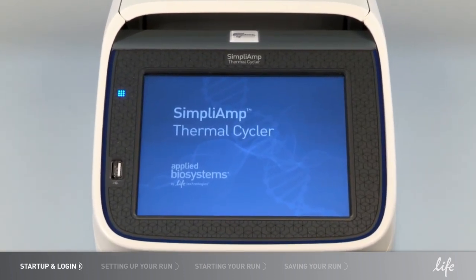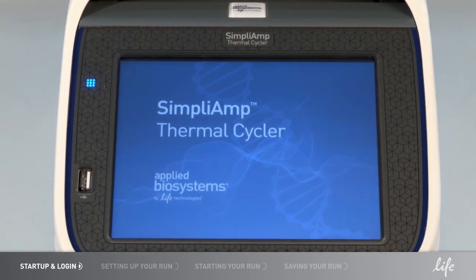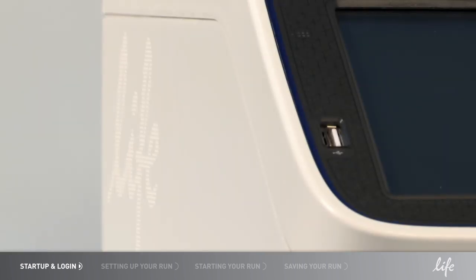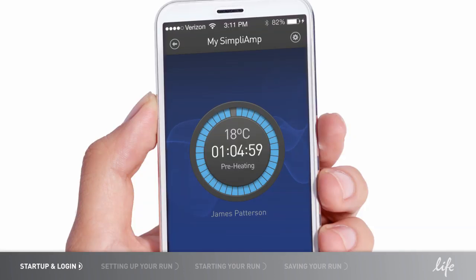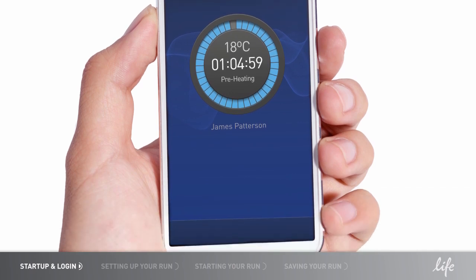The Simply Amp Thermal Cycler is simple and easy to use. It's designed so that you can set up a run, program and start your experiment right out of the box. You can store, save and run your program with your USB drive — just plug in the USB drive and select your options from the touch screen. In addition, the Simply Amp Thermal Cycler can connect to your mobile devices for easy monitoring anywhere.